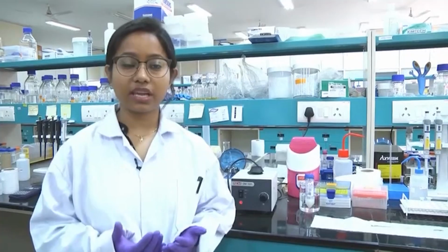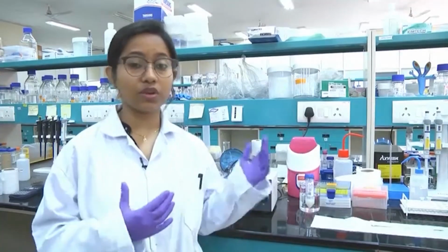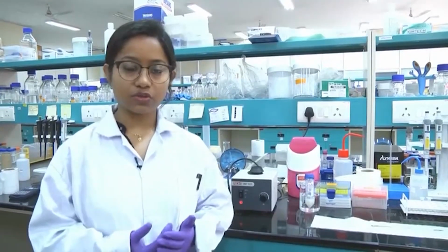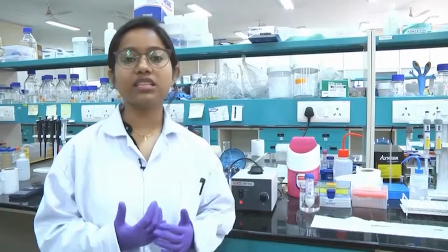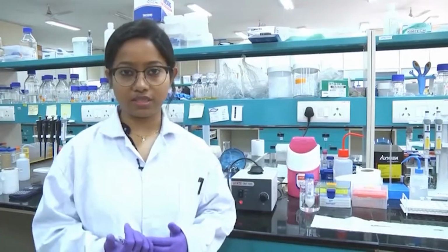If you are using bacteria, it is a very good source to get a large amount of protein, because you can grow bacteria in a large culture and isolate the protein from that. But then you need to have the protein inside the bacteria. You can do that by recombinantly transforming a particular gene or protein construct into the bacteria, and that we will do today. We have transformed the bacteria with a small plasmid which contains our protein gene, which expresses our protein of interest.